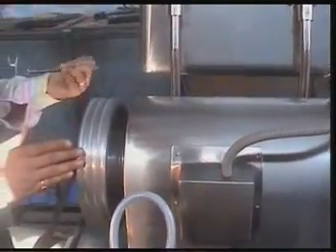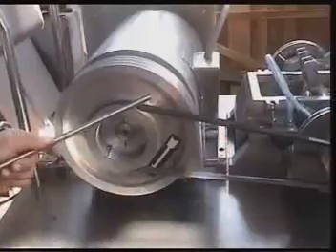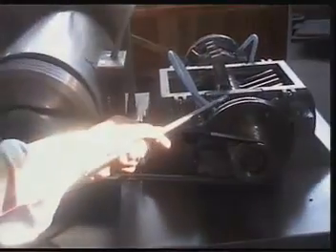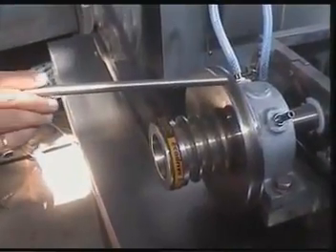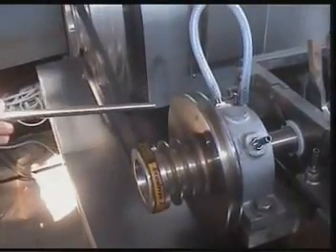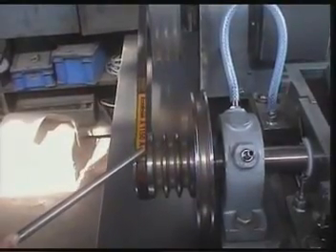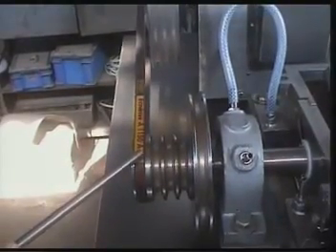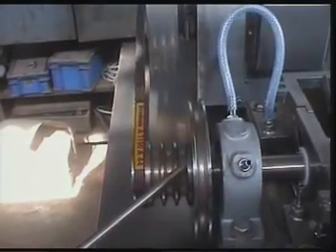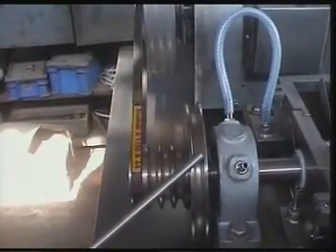Here is an aluminium pulley mounted with the main motor, driven with a belt. And here is a pulley mounted with the chamber, driven with the belt. The first groove is given for 2250 RPM, the next three grooves are given for maximum RPM that is 4500 RPM, and the last groove is given for the lowest, that is 1000 RPM.